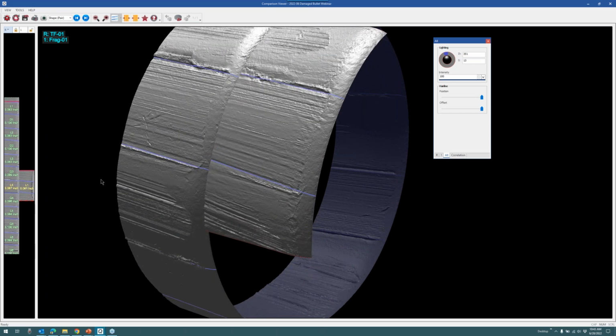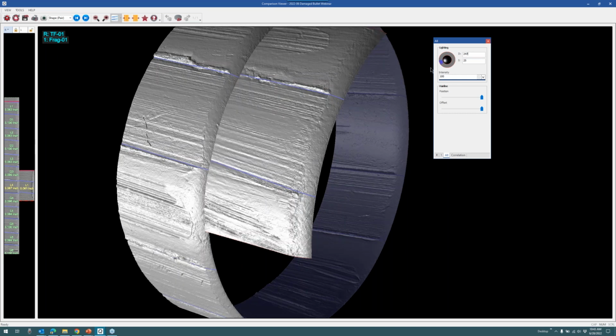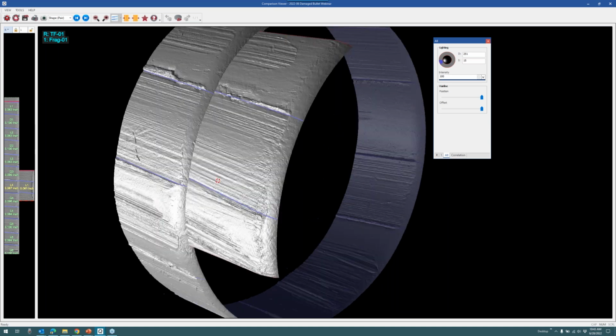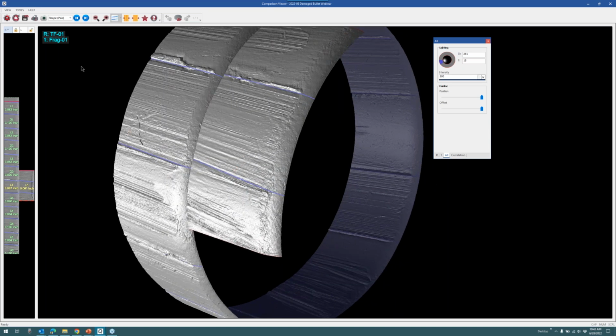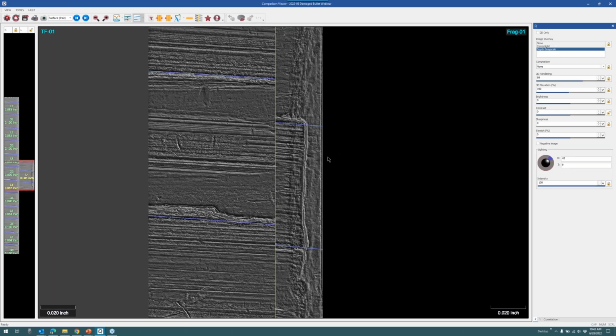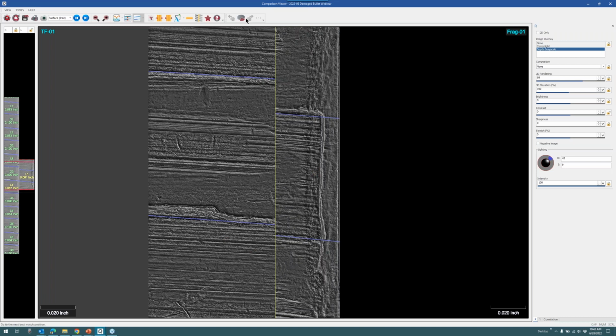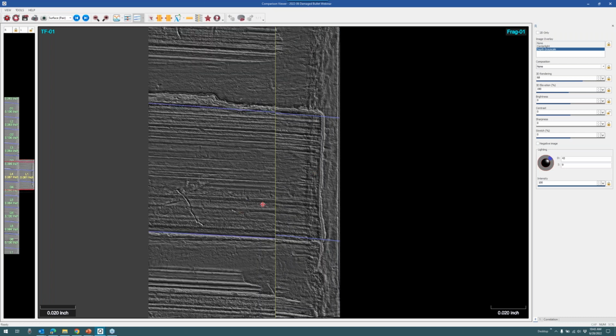But that is just getting you familiar with what is available between these two items, whether it's from the surface view where everything is flattened out, or with the original shapes applied, to just give you a better sense of what the relationship is here. So those are some different tools available to you during the comparison. Lastly here, for this particular one, let's just hit best match again to realign these.